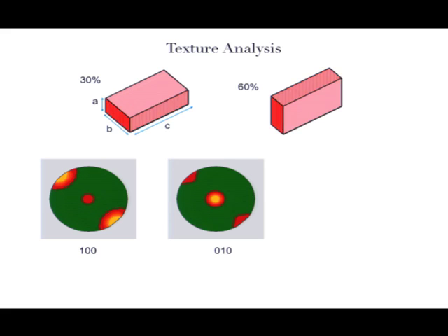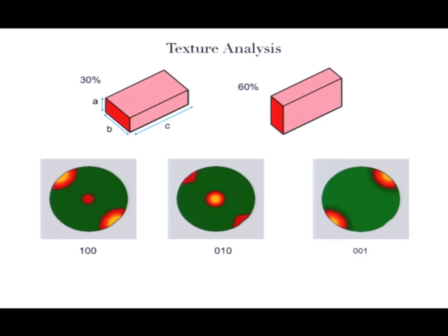And for the last phase, we get a pole figure like that. So this plot is at first will be just the intensity measured at each orientation, but then the pole figure will be normalized so that the average is 1.